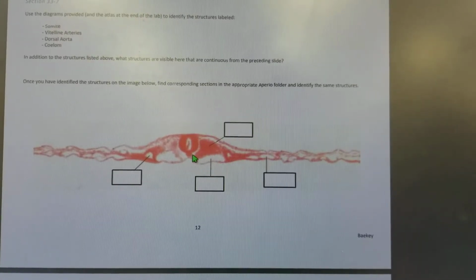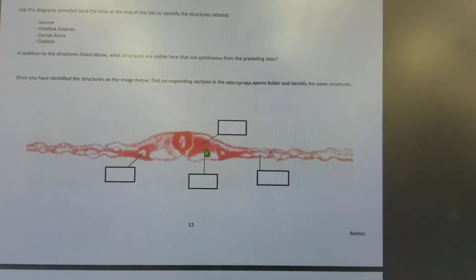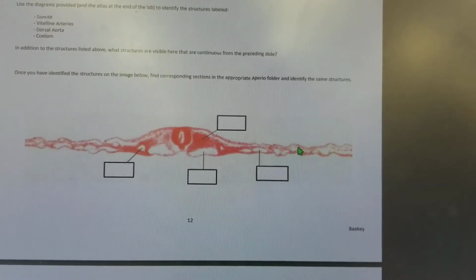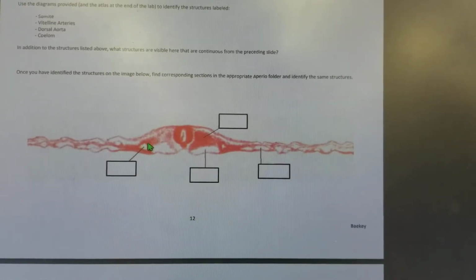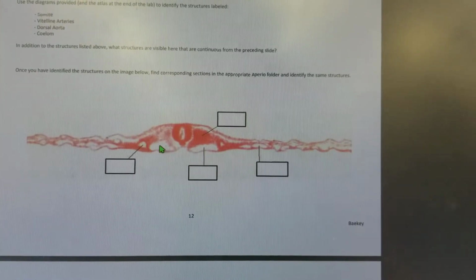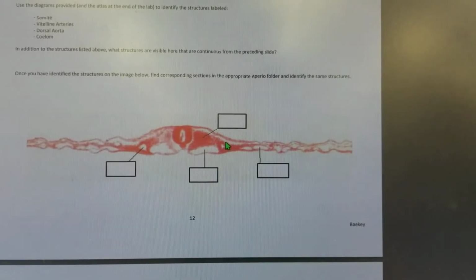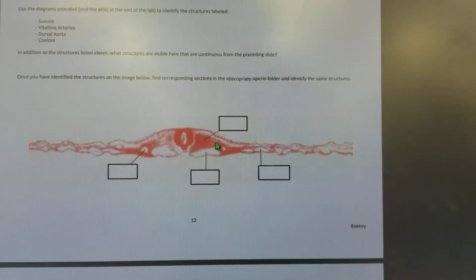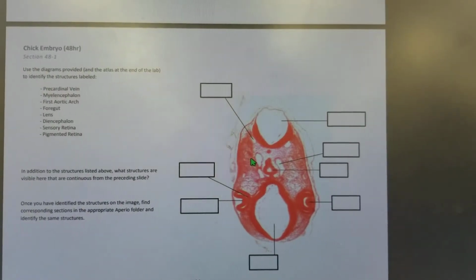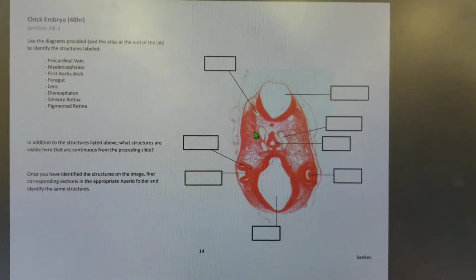Example of the somite, notochord, neural tube, right? Somite, and then here's the dorsal aorta, and out here the vitelline blood vessels, and then there's this right here. This becomes another coelomic space. These coelomic spaces are going to fuse, and when they fuse, they're going to form the intraembryonic coelom.